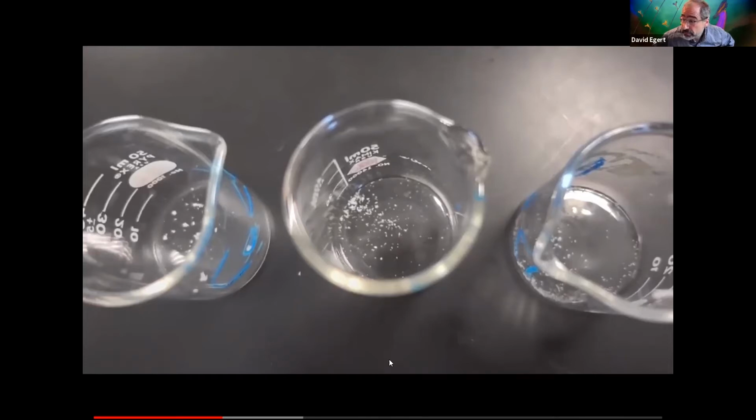But it is important to record that, because once we add the water, we can see, are they still there? Are they not there? When we do the same thing with oil, are they still there? Or are they not there? To know whether or not they disappeared, you have to have a sense of what it looked like when they were there.